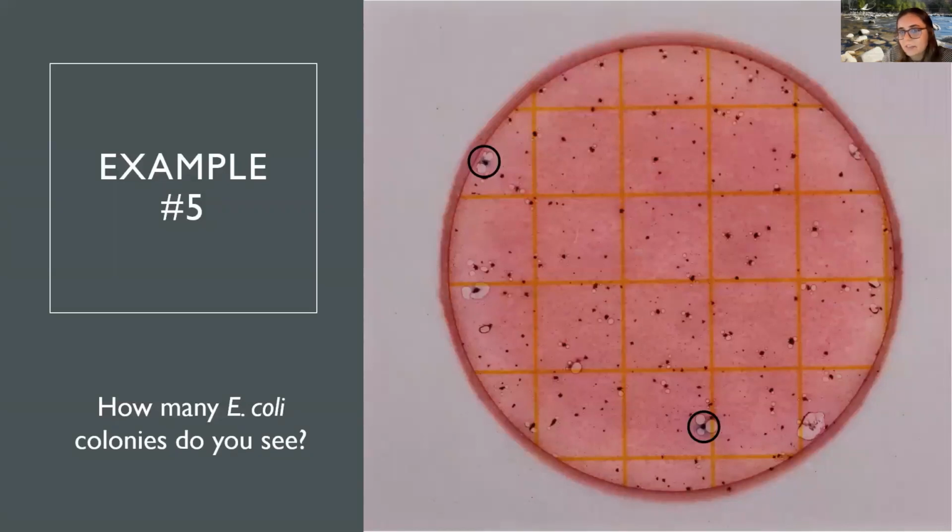Maybe the one on the far left right here is something that tripped you up. It tripped me up at first, but we're not seeing that smear again, where we can see the blue radiating out from the colony. It's just a bit darker, right? But this is another reason to bring up that as long as we're reasonably close in our counts, not way off, our calculation is going to take those potential human errors into consideration.